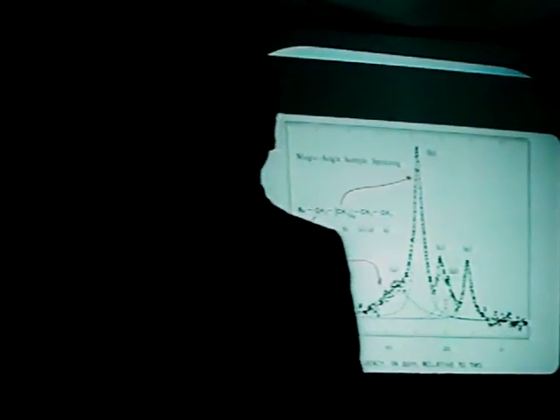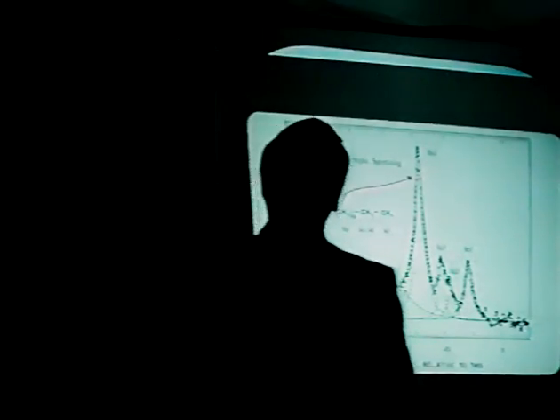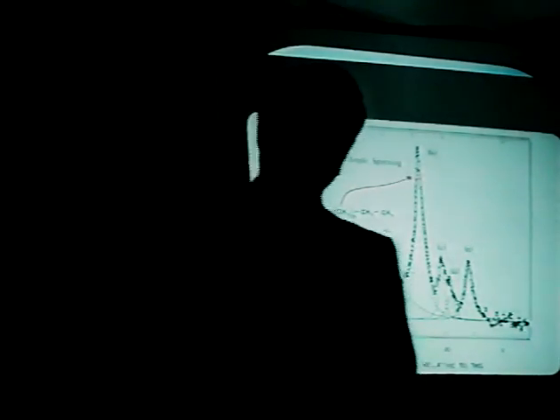No, the dipole coupling is still very efficient. It's just that the motion is even more efficient. It's already removed it through the dipole couplings. What I did point out was this was just a characterization to assign these different peaks here. We've taken these and tried to follow the chemistry in that. We find that the more mobile, the more narrow peak, is the one that's selectively depleted when you purge this with helium. Coincidentally, purging with helium tends to encourage the formation of the graphite, which would suggest by circumstantial evidence that that more mobile alkyl group is the one that's more of the precursor to the graphite on the sample there. Circumstantial. Thank you very much.